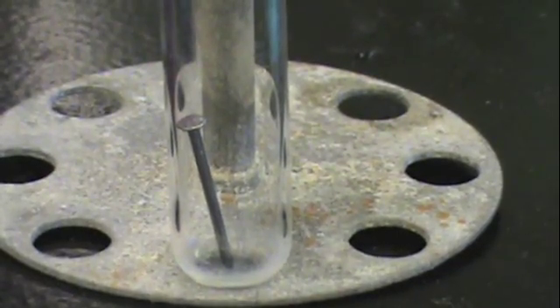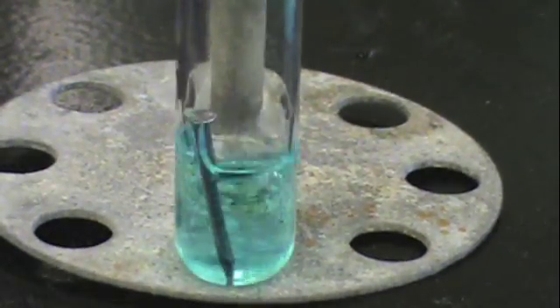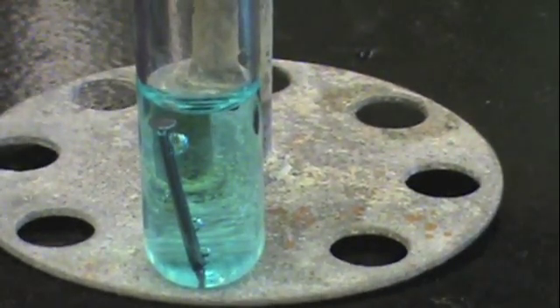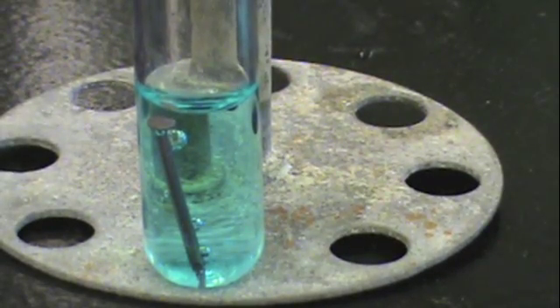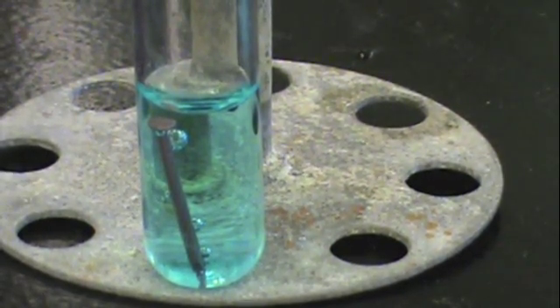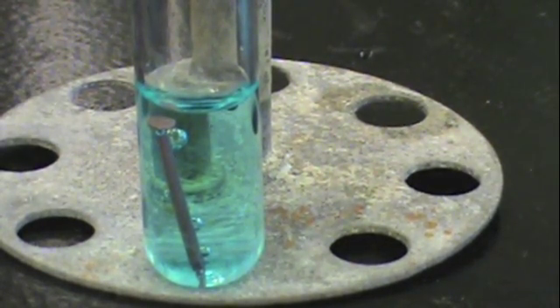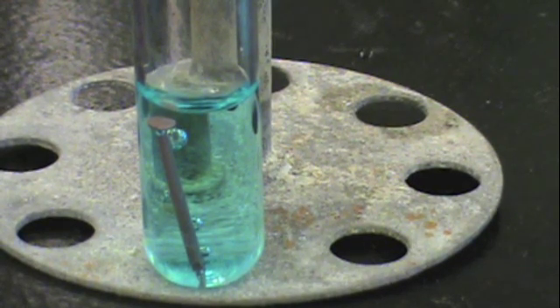The next reaction is that of iron with copper sulfate. Within a few seconds, you can see that the nail begins to turn reddish-brown. This is not the formation of rust, but rather the depositing of copper metal on the nail. This means that there is definitely a reaction happening between copper and iron.